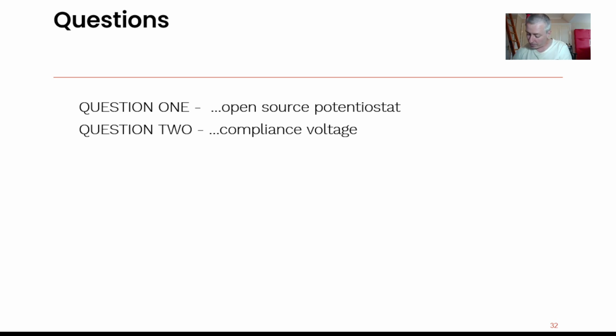It wasn't a problem when we had potentiostats that look like this, but potentiostats now in electroanalytical chemistry shouldn't look like this, because I think it stops people imagining how they will actually end up commercializing this.